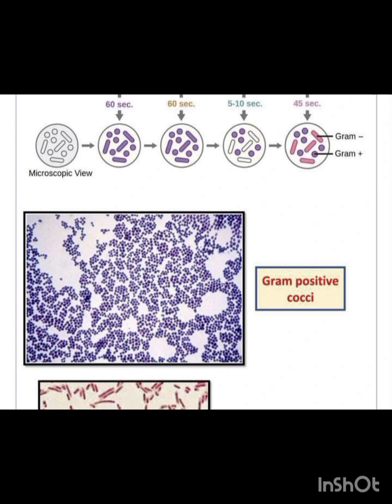And as we know, staining is very important to identify different types of microbes based on their shape, based on their color. So it is a very important technique for microbiology.